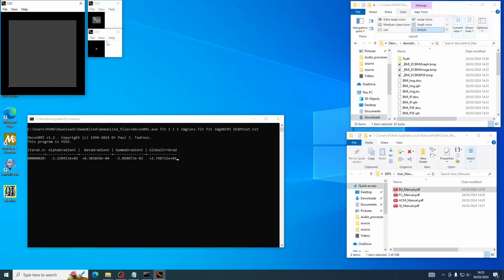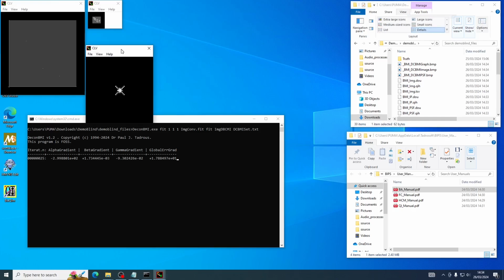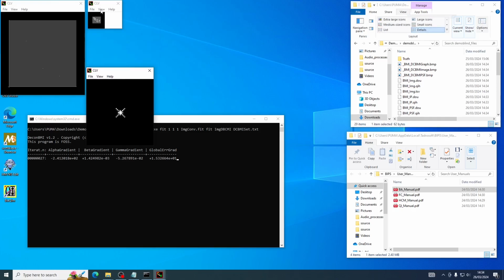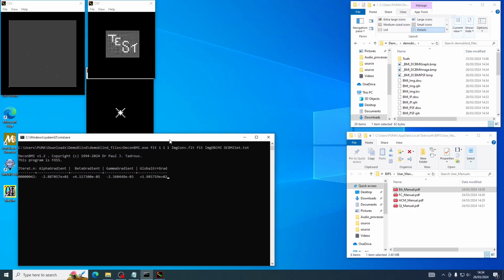You can make these images bigger. So view zoom times 4, for example, that's the current estimate of the point spread function. And you can say view times 4, that's the current estimate of the image. You can see we're on iteration 35. We're coming down on the residuals very nicely as the estimates of the solution and the PSF get better and better.